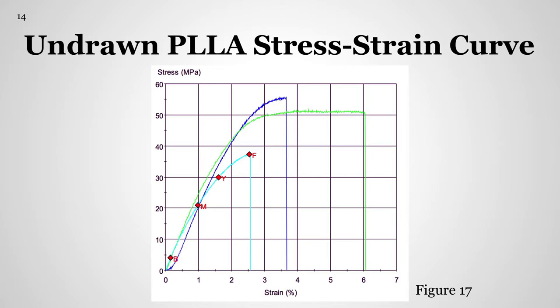Following this, there is the viscoelastic region from M to Y, in which deformation is partially recoverable and the fiber begins to undergo creep, in which strain increases even while stress remains constant. Following this, after yielding at point Y, from Y to F, the fiber undergoes plastic deformation, in which deformation is entirely non-recoverable, and this continues until the fiber ultimately breaks at its failure point, F.